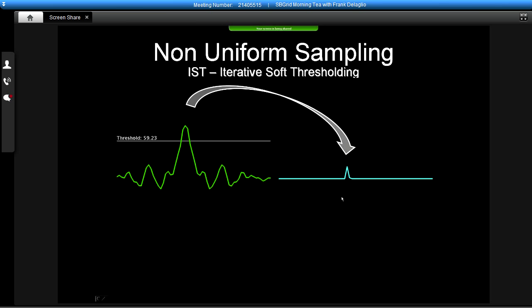So we get a little signal in our accumulated spectrum, and we get a result which is a little smaller above the threshold and exactly the same below the threshold. We don't change anything below the threshold here. All we do is scale down what's above the threshold a little bit. And now we can take this reduced result and inverse transform it back into the time domain and set to 0 any parts that we didn't originally measure and transform the result back.